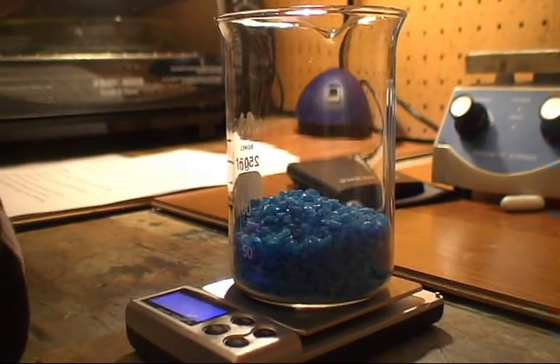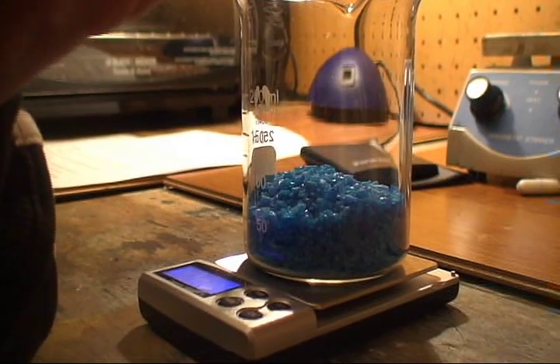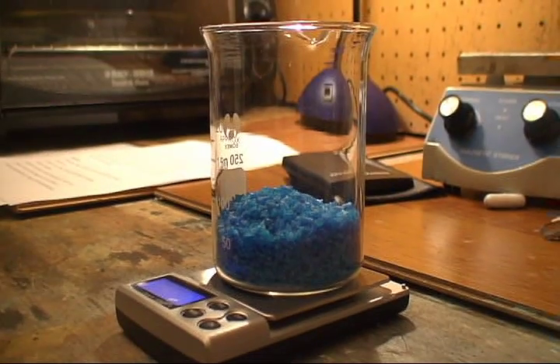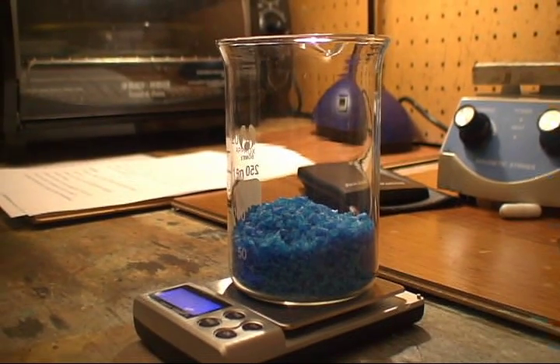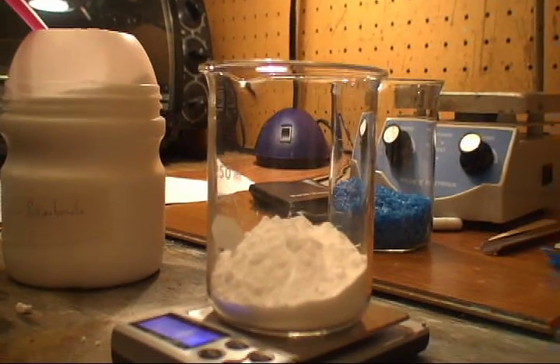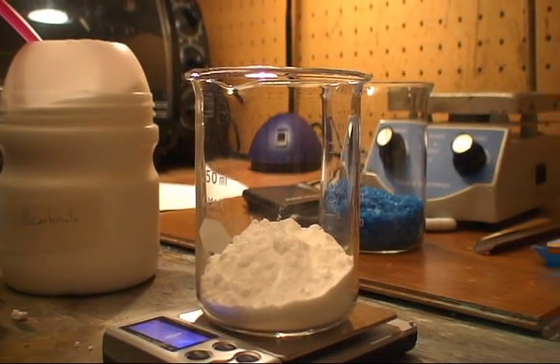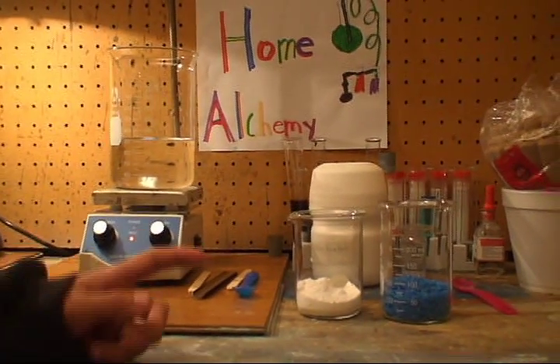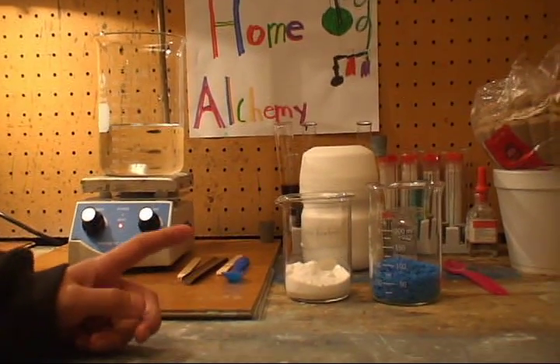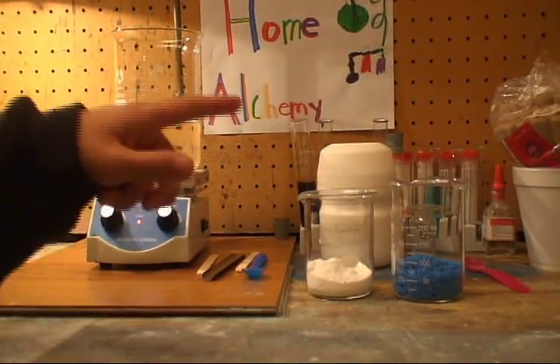Here we have about 100 grams of pure copper sulfate. Here I have 67.2 grams of baking soda or sodium bicarbonate. I have now weighed out the two chemicals — baking soda and copper sulfate.